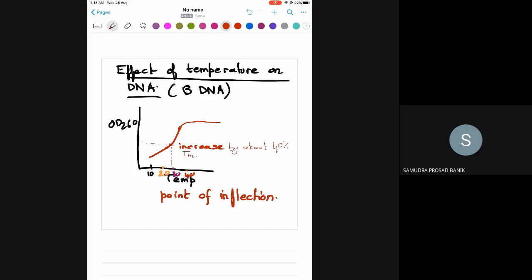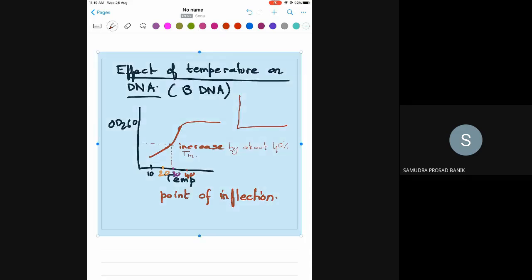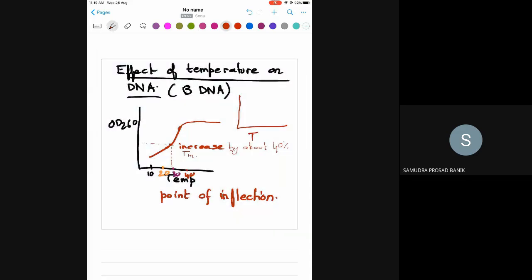Okay, now we come to this kind of change where the OD increase happens very suddenly. Earlier we did this in the case of enthalpy. Now, instead of this graph, if I plot temperature on this axis, and on this axis dOD/dT, we plot the rate of change of OD with temperature.